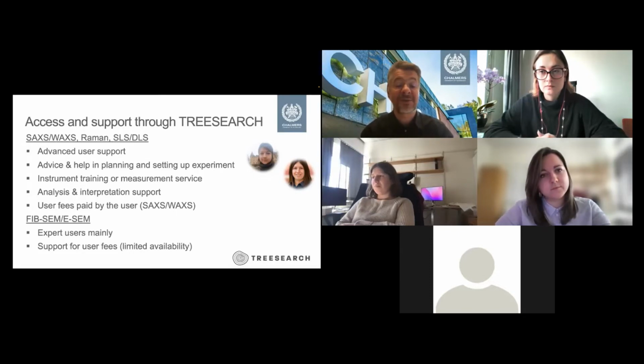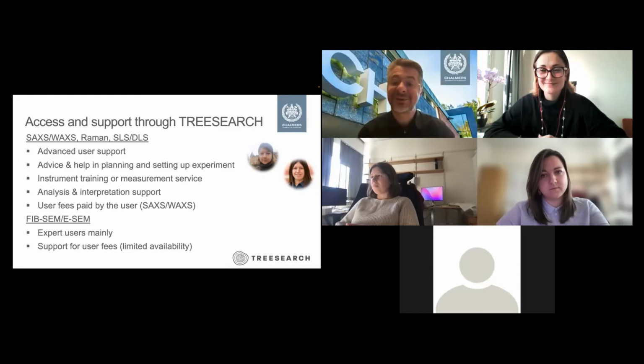So if you are an expert user, we can at least to some extent support the user fees on the FIBSEM or ESEM. And I think if you're interested in these instruments, a good way is to approach Anastasia, who is an electron microscopy expert, and she could probably work out with you how to use them in the best way and maybe even accompany you to this experiment.